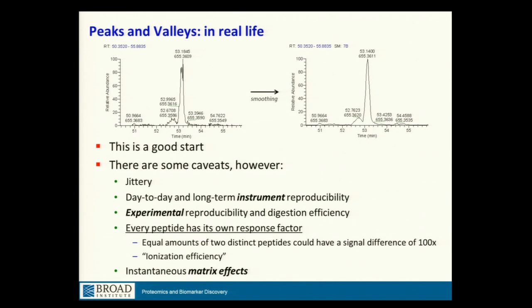This is this ionization efficiency that plagues us in mass spectrometry, and why we don't have the magic solution to say, hey, can you shoot that in there and tell me how much of that thing is in there? Because we don't know. You can empirically determine these efficiencies for peptides on a one-by-one basis. It's very time-consuming and expensive.